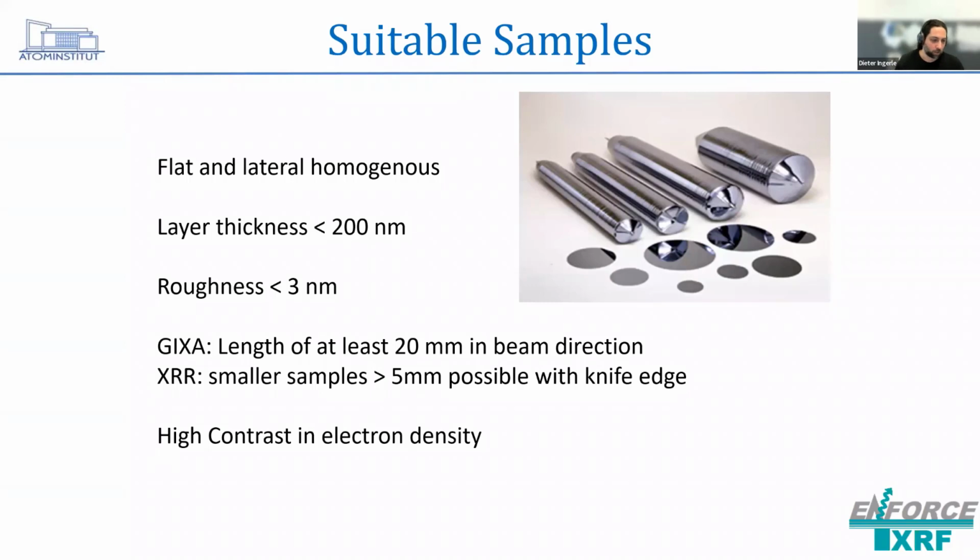So depending on energy, of course, you can change it, as I will maybe show you a little bit later. You can basically play a little bit with the energy of the incident beam to get maybe better contrast for these thicker layers. But anyway, I'm quite happy if I have layers below 50 nanometers.